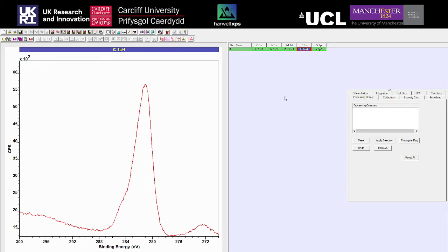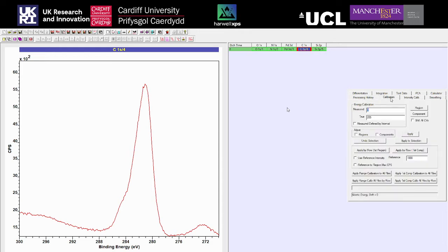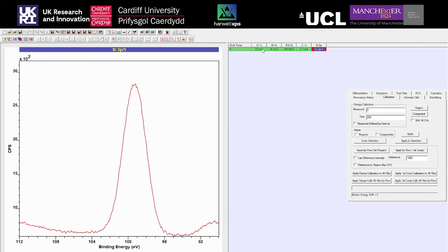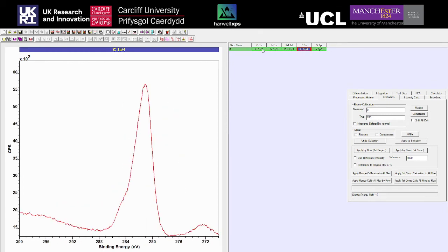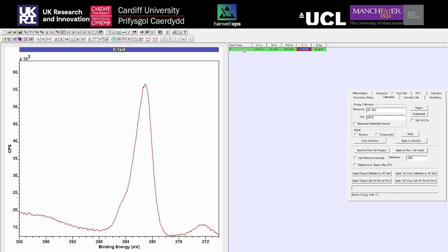Under Spectrum Processing or pressing F8, you can bring up the spectrum processing window - just open up the calibration tab. You can scroll through your samples and pick a region of interest. Going to the carbon, the simplest thing is to click on the peak maxima. Here we've got about 281 eV and we're going to shift this to 284.8. There are a range of values chosen, but generally between 284.6 and 285. When comparing to literature, make sure you know what the data has been calibrated to.